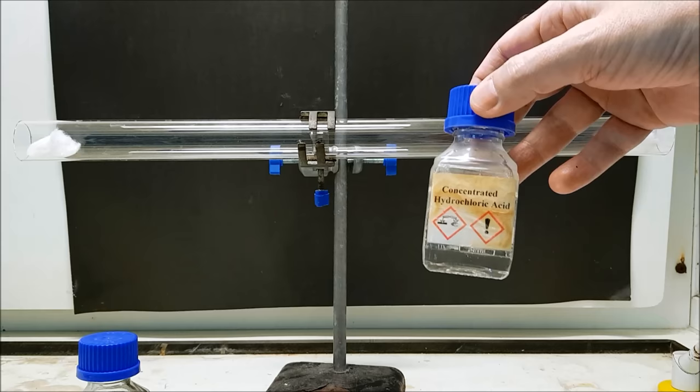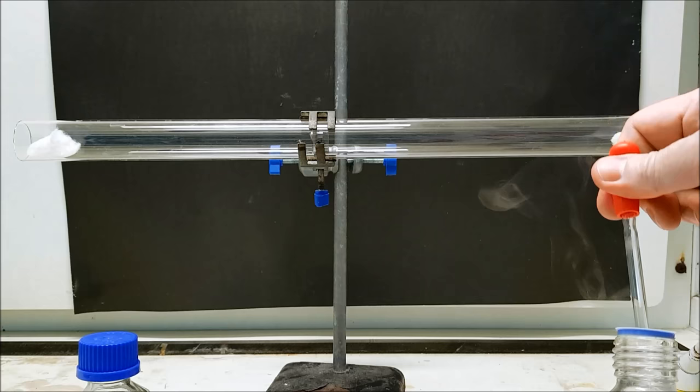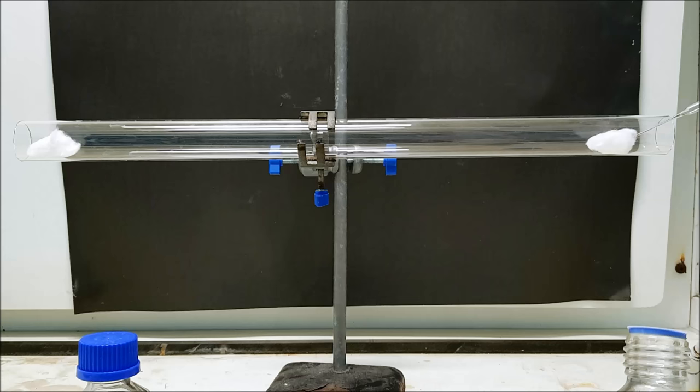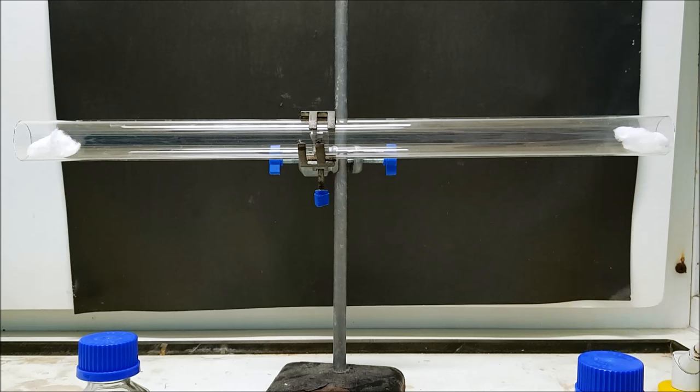Ammonia and hydrogen chloride diffusion experiment. Here's some concentrated HCl. If we place a few milliliters onto the cotton wool there on the right hand side, we can close off with a bung.